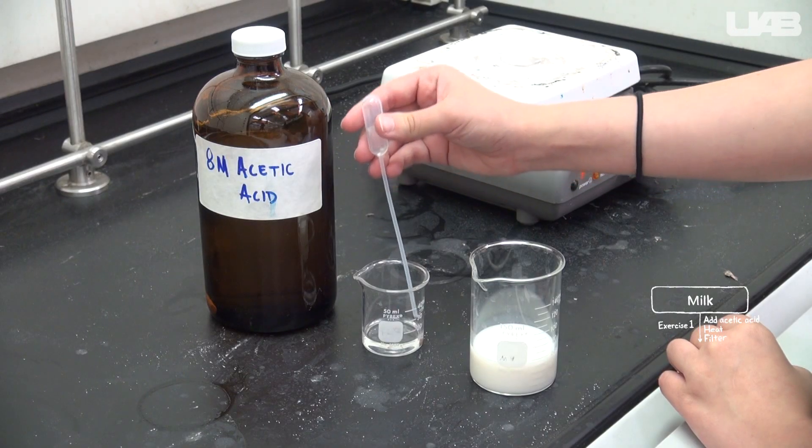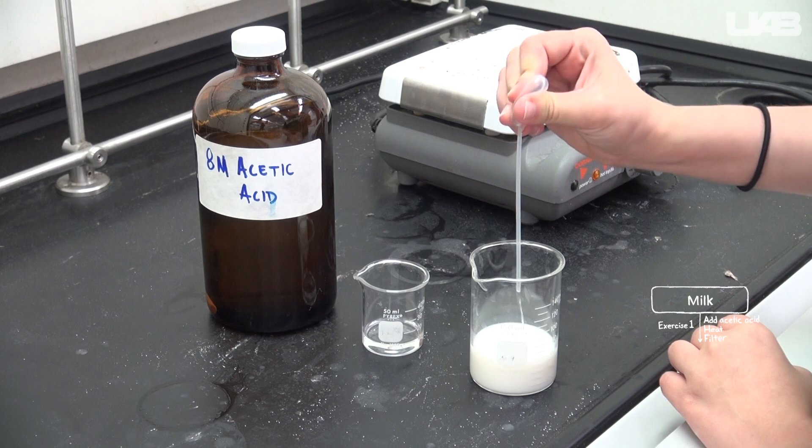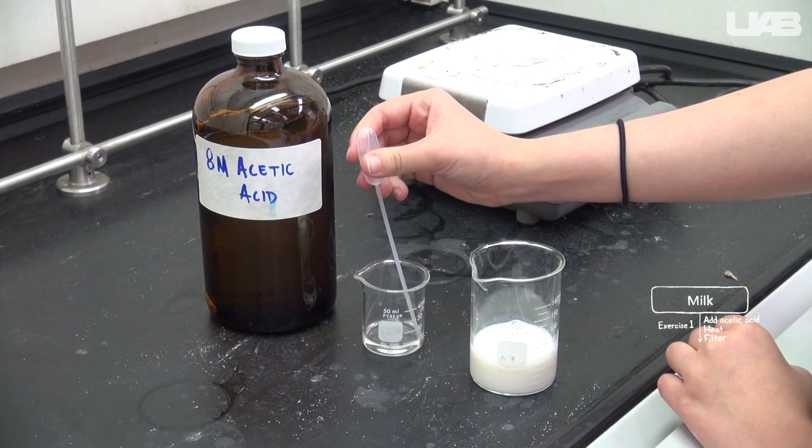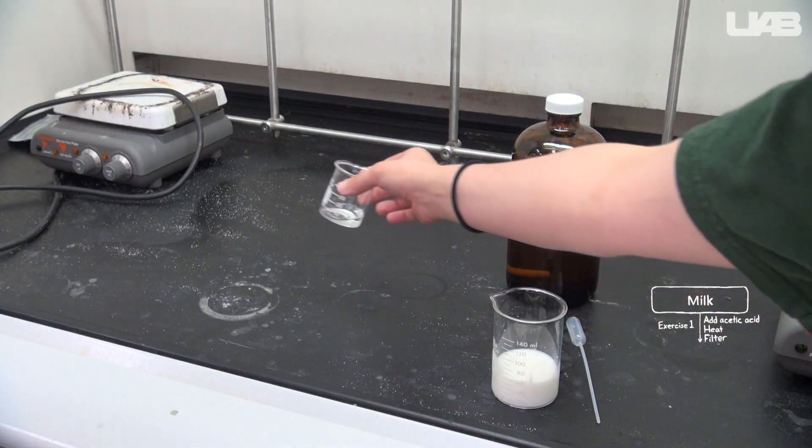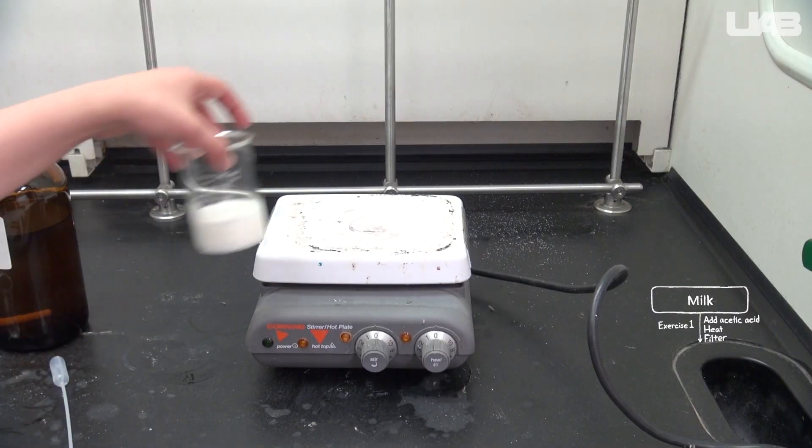Move to the hood and add one milliliter of eight molar acetic acid to the beaker. Make sure you pour the acid into a separate container before touching it with the pipette. You and other groups can share this container. You will need about two pipette holes.